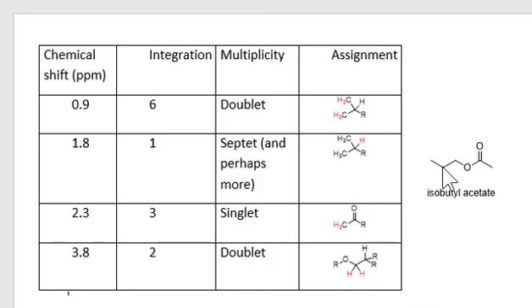So this carbon right here is bonded to 1 hydrogen, and it is next to the CH2 group that's bonded to the oxygen. So we've pretty much used up all of our 6 carbons and our 12 hydrogens and our 2 oxygens. The only thing that still needs a bond is this carbonyl, and so we just connect those 2 fragments together and our molecule is finished, and we wind up with isobutyl acetate.